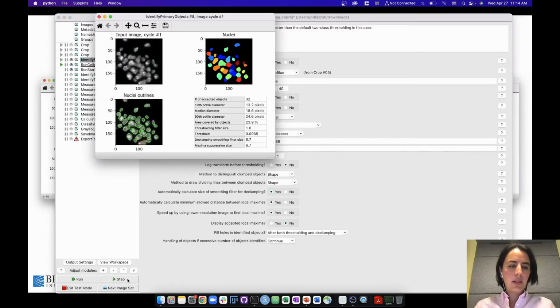So if I step through it, you'll get the segmentation for this object, avoiding things that were too small or things that are touching the border, and you get the segmentation of the nuclei. As you can see, it actually does a pretty good job. Maybe some under-segmentation in some areas, but overall, a pretty good segmentation of the nuclei on this type of images.